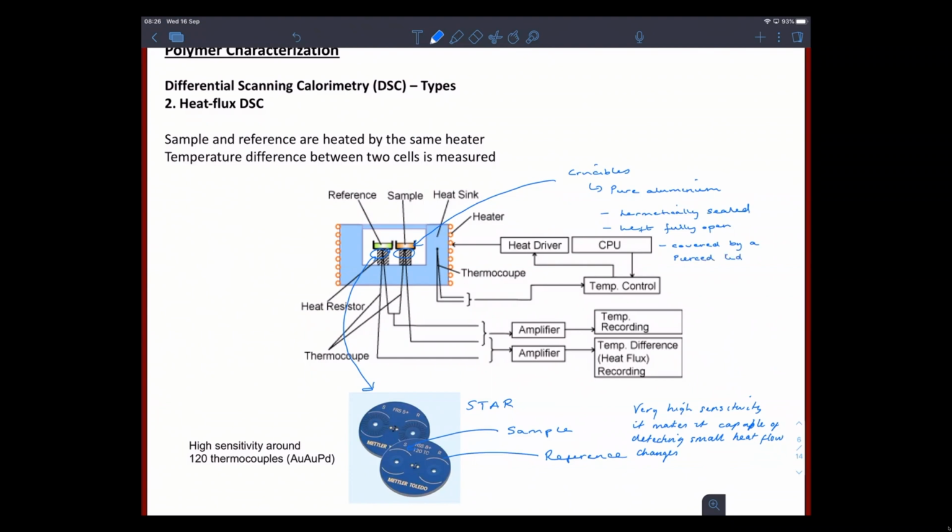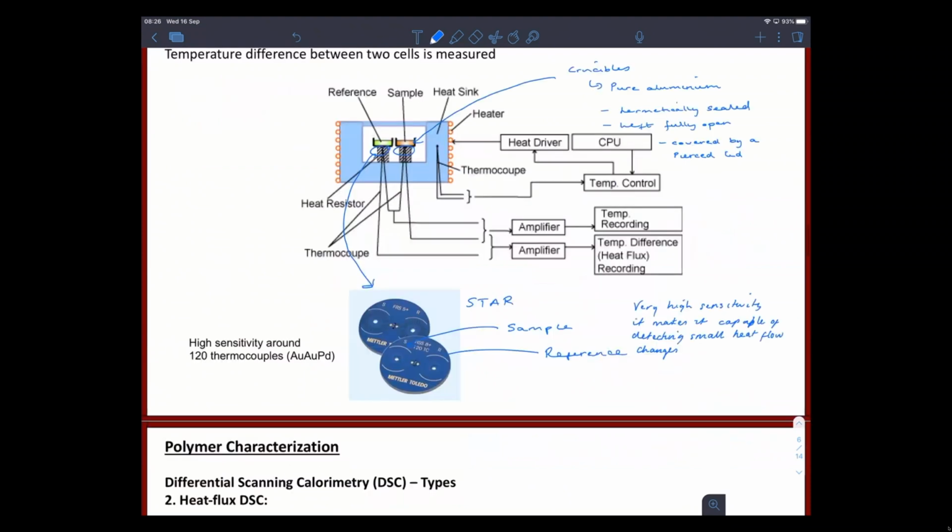So that's what they do in the Mettler Toledo YouTube video. But obviously the piercing in that lid determines the degree of gas exchange that is undergone with the surroundings, so it can have an influence on that. You can also have, unsurprisingly, gold crucibles, which are available for samples that react with aluminium. So there are lots of alternatives out there.